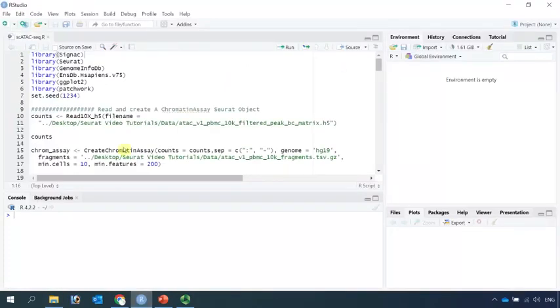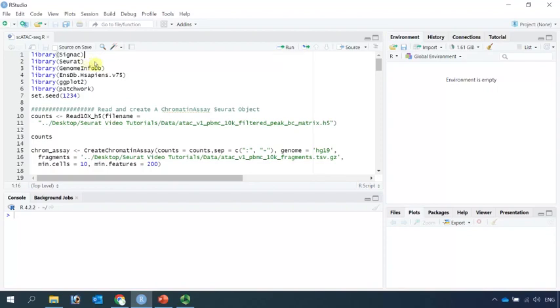First, we need to load all the packages. SIGNAC is required for ATAC-seq data analysis. We also need Seurat and the human genome information and the human gene information from Ensembl database. Let's load the libraries.